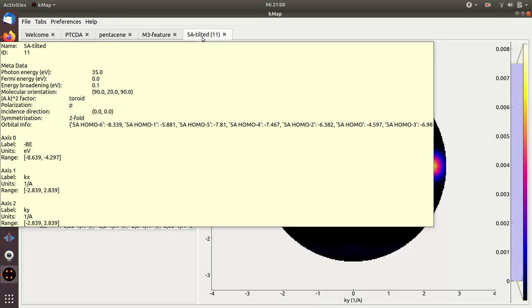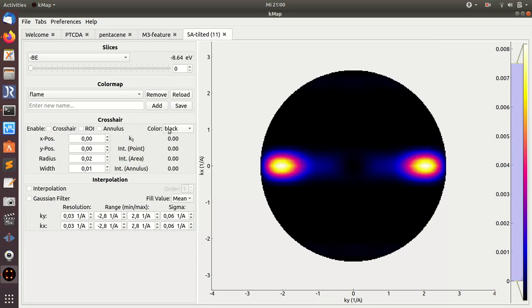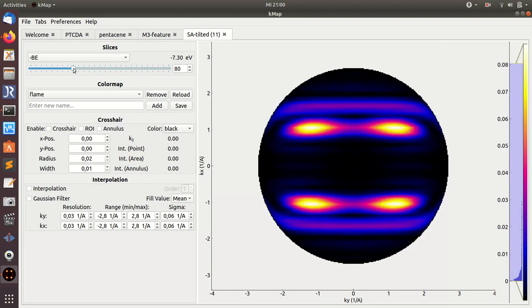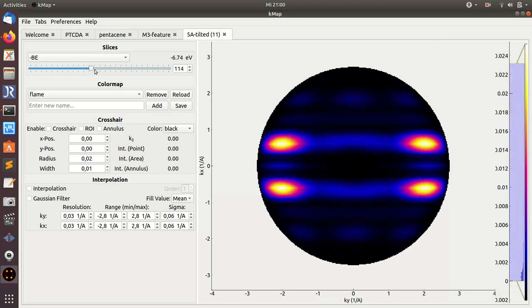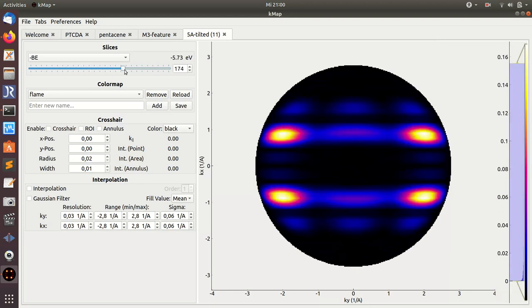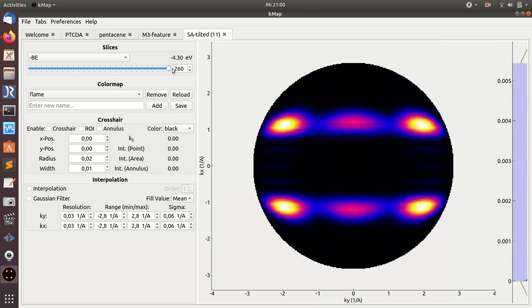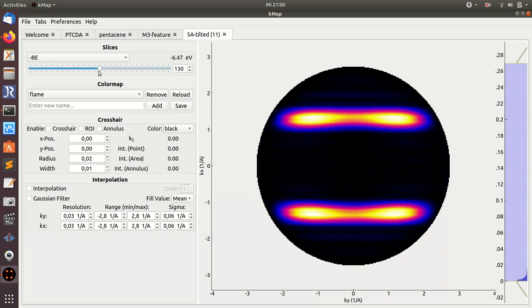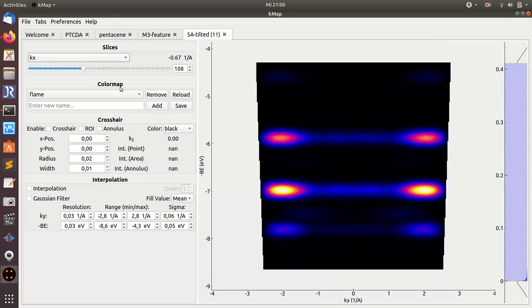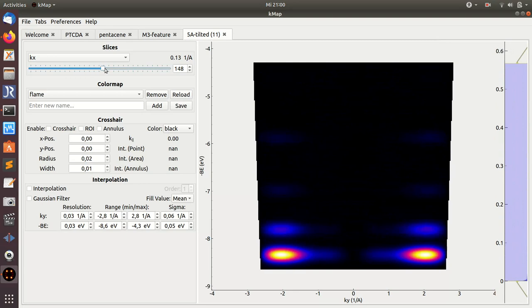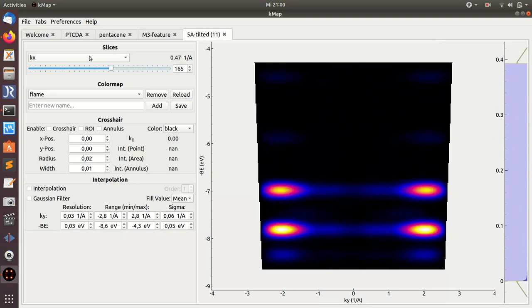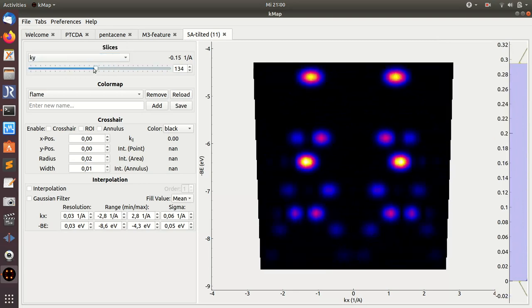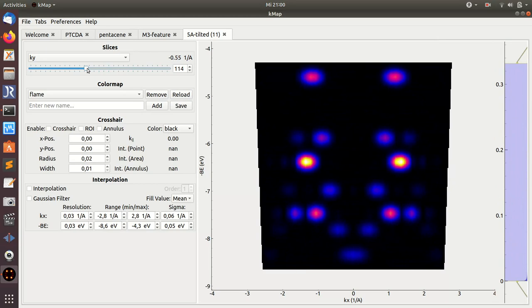Information on the three axes: energy, binding energy, KX and KY. And I can scan here, for instance, through binding energy, and I see these different orbitals popping up, which I can see in a better way if I go to a band map representation. Here, for instance, something like this. Maybe you see this typical intramolecular dispersion.